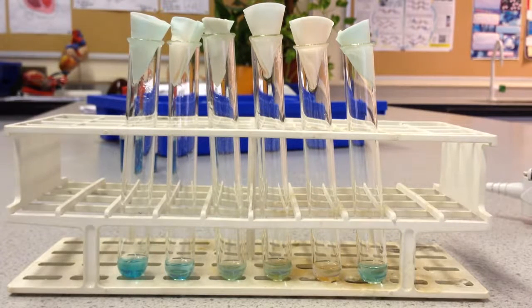So I poured the solutions through a filter paper and into a second test tube. So that removes all the red precipitate that's formed, and what's left is, in theory, just the remaining copper ions in solution. So we're just looking now at a more uniform set of solutions in which the only difference is the amount of copper that's left in the solution.